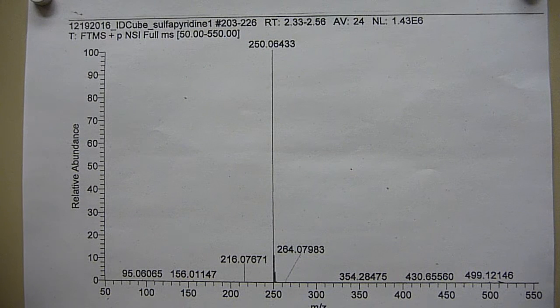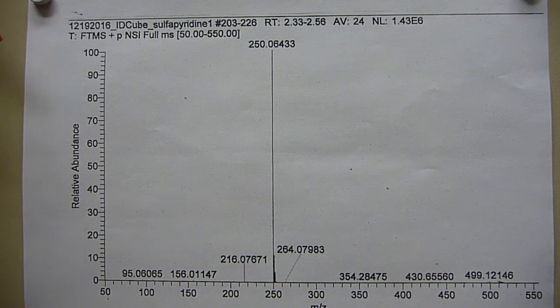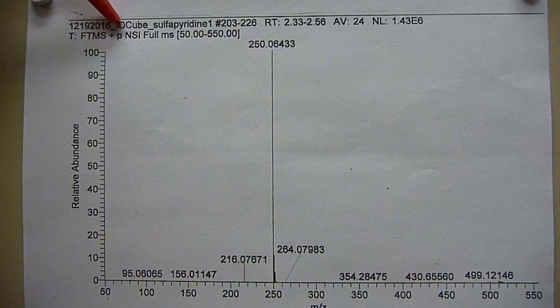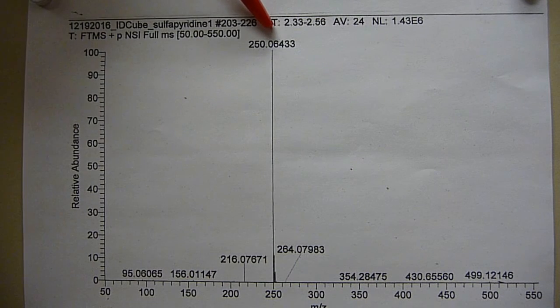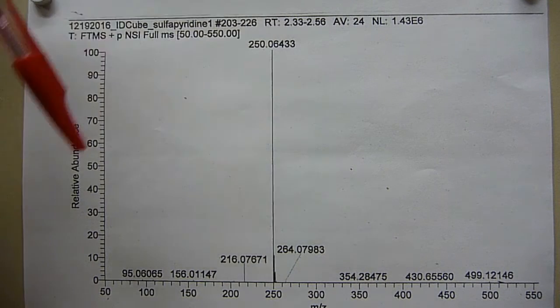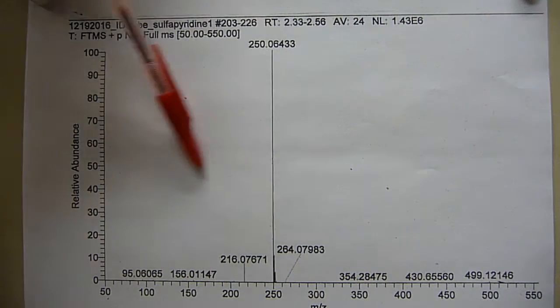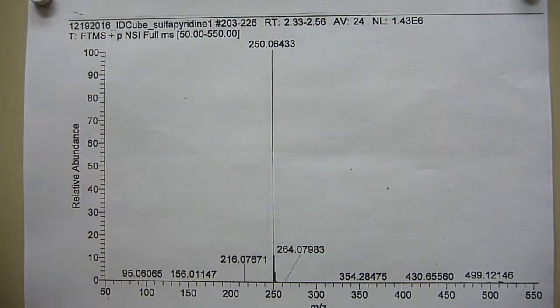Okay, quick 10-second each spectrum recap. This is the DART Spectrum — big M+1, very little fragmentation.